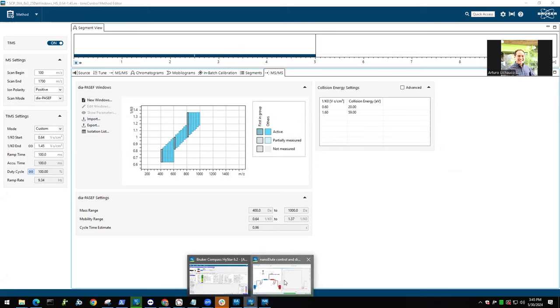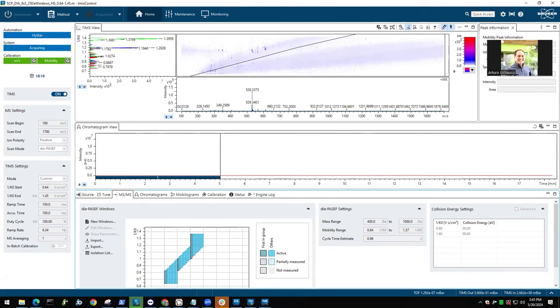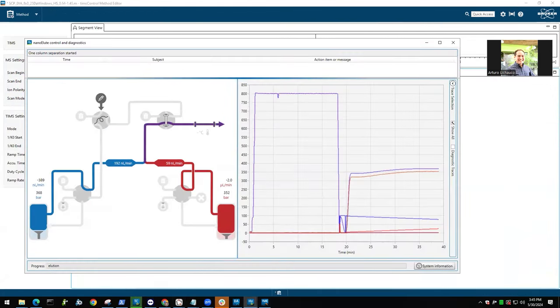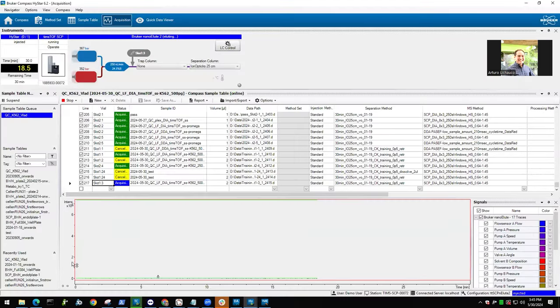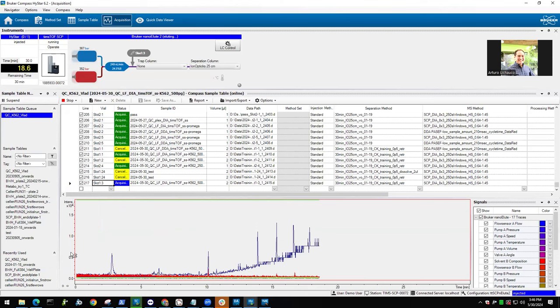Okay. So while I was talking, we're already halfway through the gradient. Let's see if we can actually see some molecules. I think we have issues with the pickup, or somehow we can't get the sample on the column. I don't know why. Yeah, but the column should be equilibrated, and we had the issue before as well. I have to look at the system, unfortunately. Not sure if something is wrong with the sample loop, or... Did this happen in the morning, this one? Yeah, first I thought the column wasn't equilibrated, and we lost the sample, but no. Okay. We have to troubleshoot this.